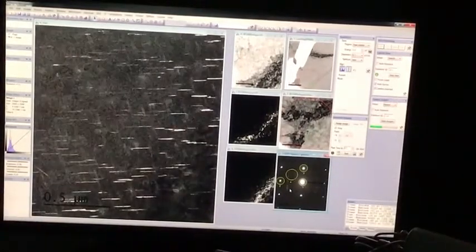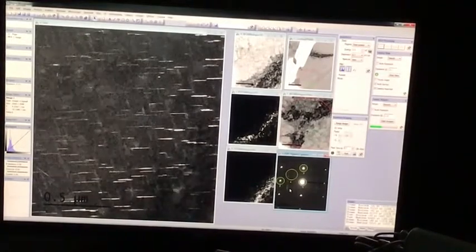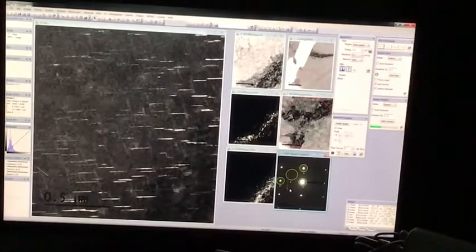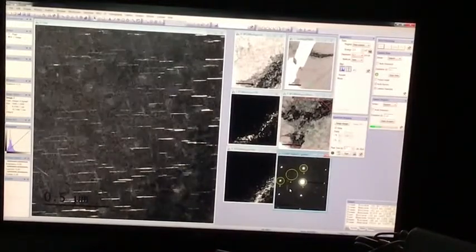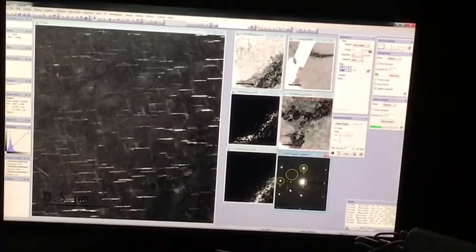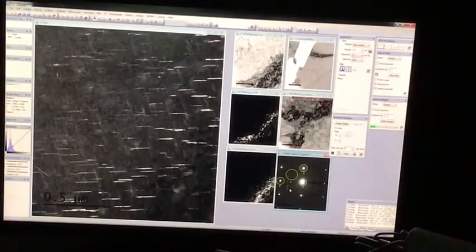So now, this is what you get. Ta-da! Quite nice. So these are precipitates, very clearly. It's a dark field image. So we're basically using the diffraction pattern and the objective aperture in the diffraction pattern to filter out different directions of scattering and different crystal structures, as well as different bends, orientations of the specimen will diffract intensity into different reflections.